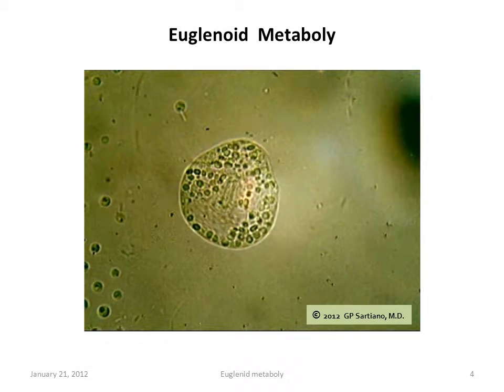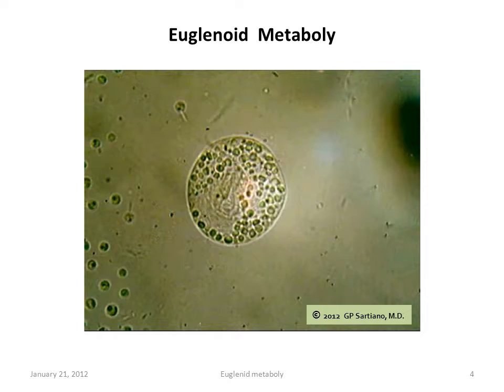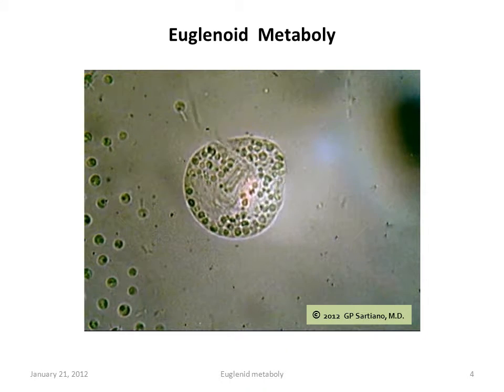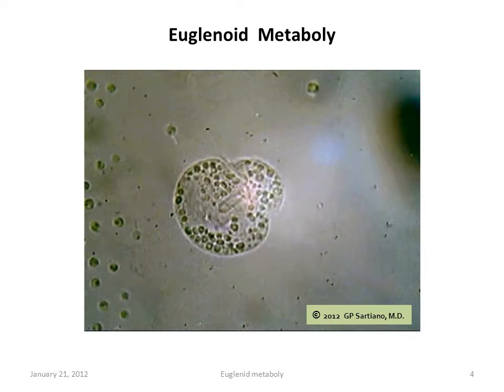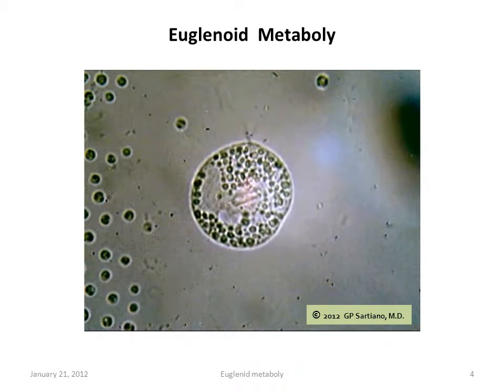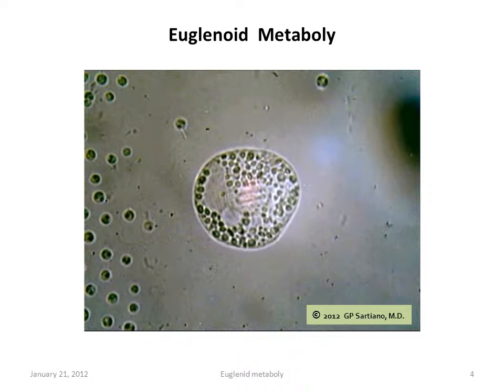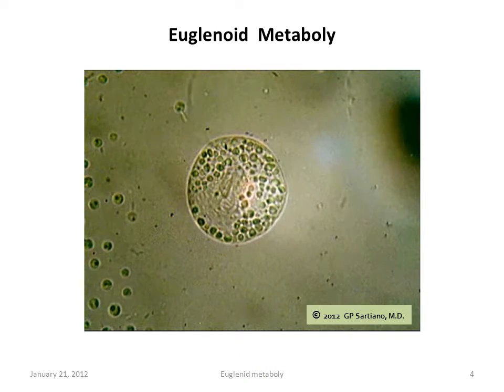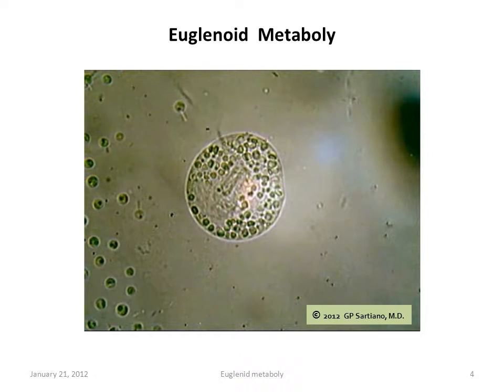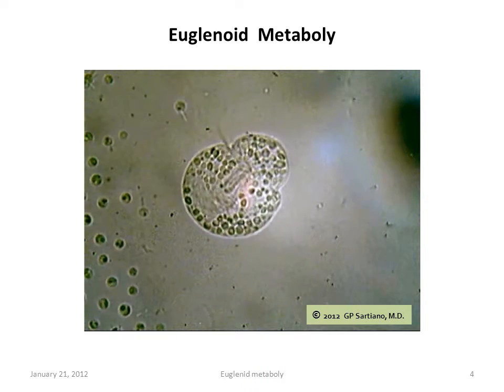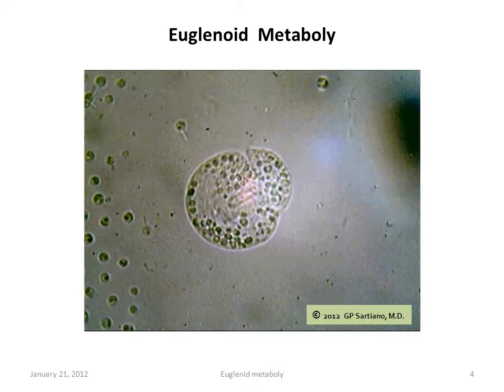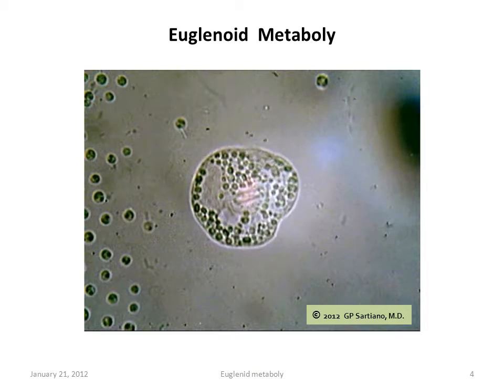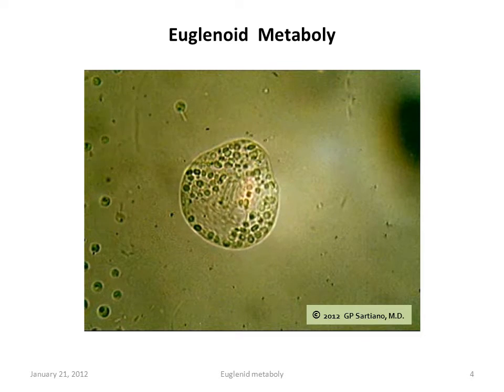It is well known that Peronema has a second flagellum, the recurrent flagellum, which is generally adherent in a groove on its ventral surface. In this video, there is a suggestion that perhaps rarely, during extreme metaboly, this second flagellum becomes sufficiently freed up to become visible as a second motile flagellum.